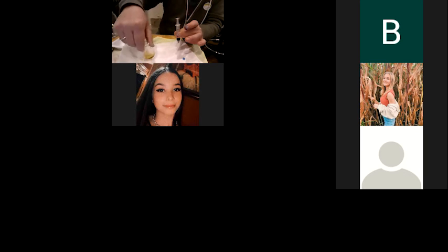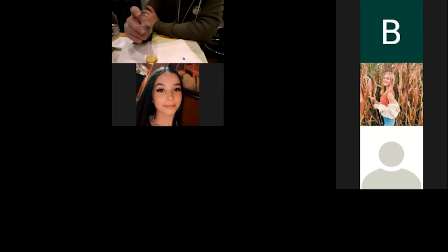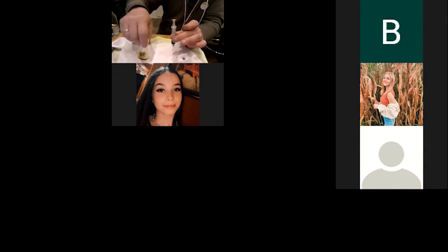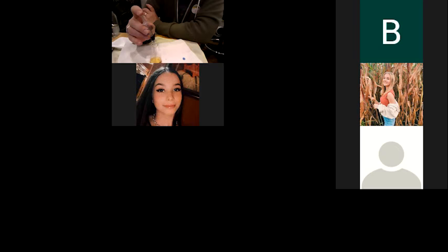That's why it helps to have a little bit more volume in here, because that makes the mixing a lot easier. So it takes a while because you definitely want to go drop by drop. That's the secret to a really good titration: you want to be just about half a drop over and no more. I'm just going to be adding like 2 drops at a time now.